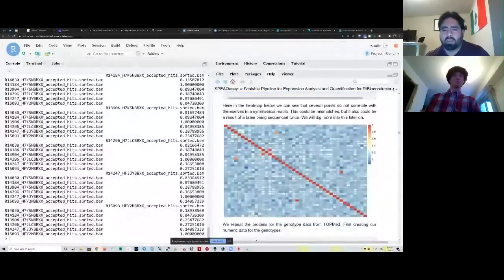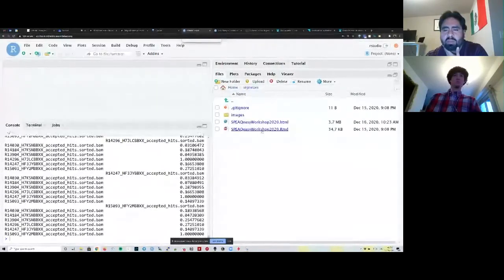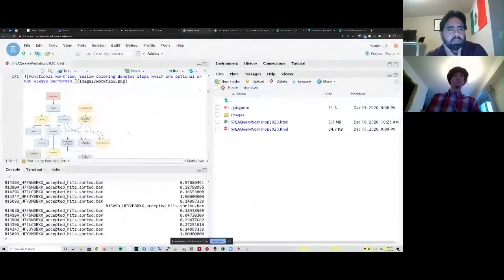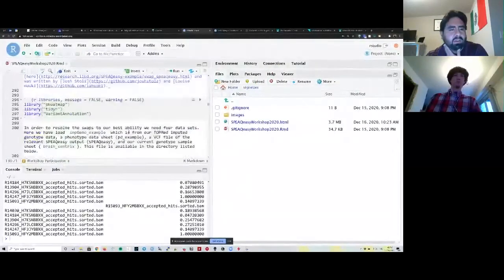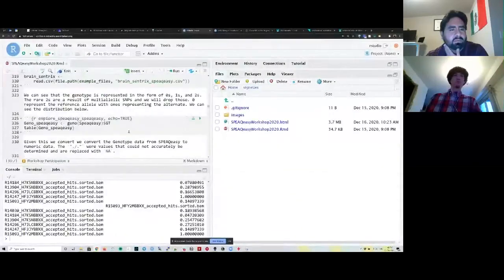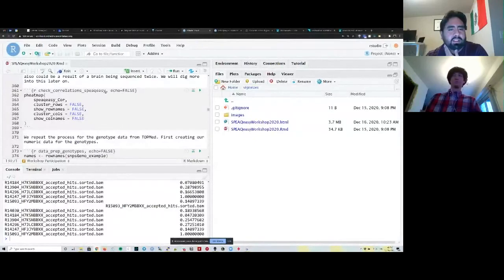And so once we have that correlation matrix, we can make it into a little heat map. So actually, let me go to the files panel under vignettes to open the code for that heat map, which I accidentally forgot to show. I forgot to set that to echo equals true.